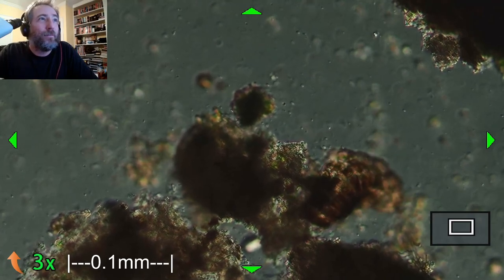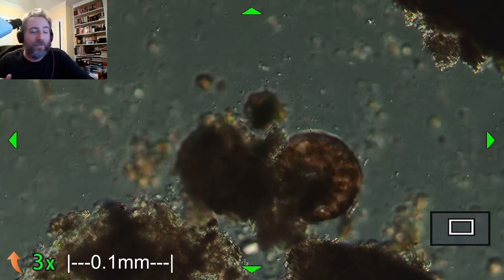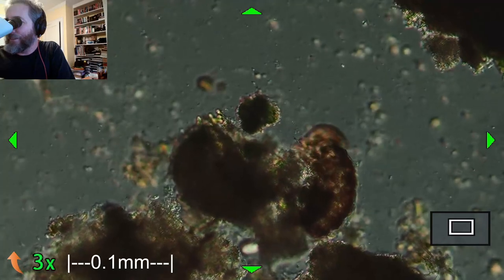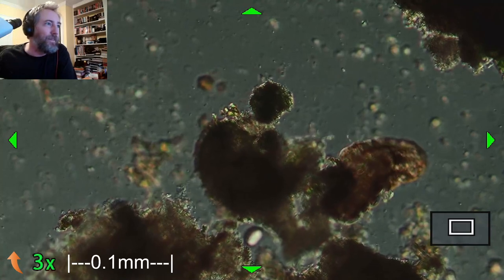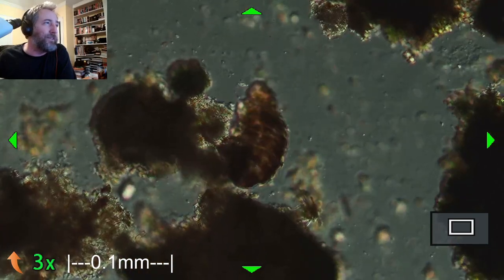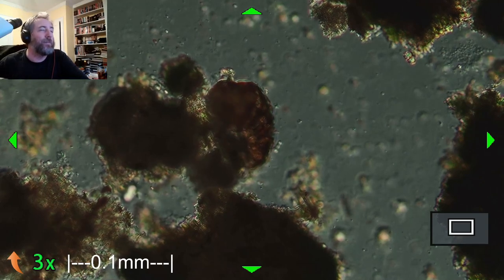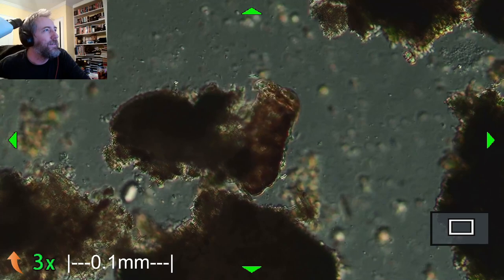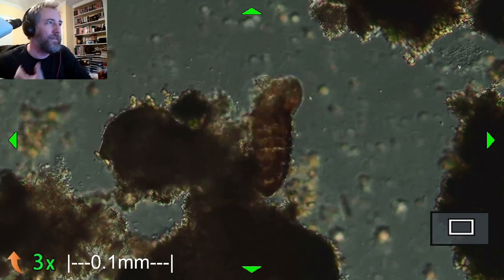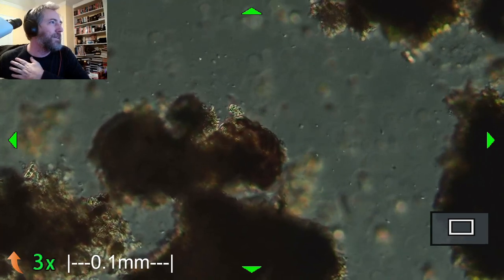Okay, so hopefully, Janjir, I answered your daughter's question about water bears. They probably couldn't live like that next to lava. If the waters were hot, but not quite 500 degrees Celsius hot, they could probably live in it for a short time. Some water bears are basically adapted towards cold conditions. They will only activate when the temperature gets below a certain range. So they do really well in places like Antarctica or high elevation places. Some of them are a little more temperate, like this one, because we don't have super cold temperatures in Indiana typically, and not for long anyway.